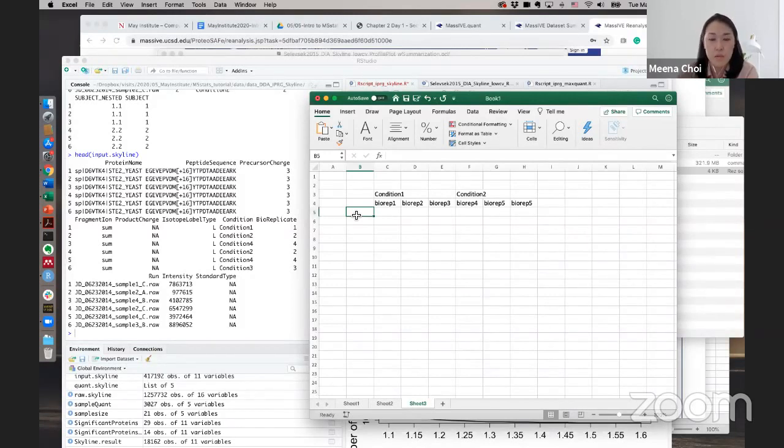So this is a protein. Let's say we have a value for every replicate. We commonly call this balanced, which means we don't have any missing value. It's completely filled, and then we can test it. So we just compare three and three, right? If you have one biological replicate missing, we can still test. We still have two versus three. Here, we are also missing one biological replicate for one of the cases. Still, we can do this, right?